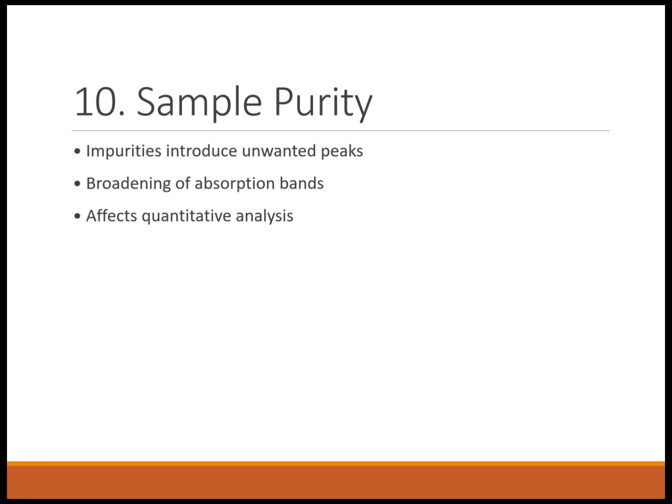Impurities can also introduce unwanted peaks, as if other molecules are present in the sample, they will also give their peaks. They can broaden absorption peaks, affecting quantitative analysis.